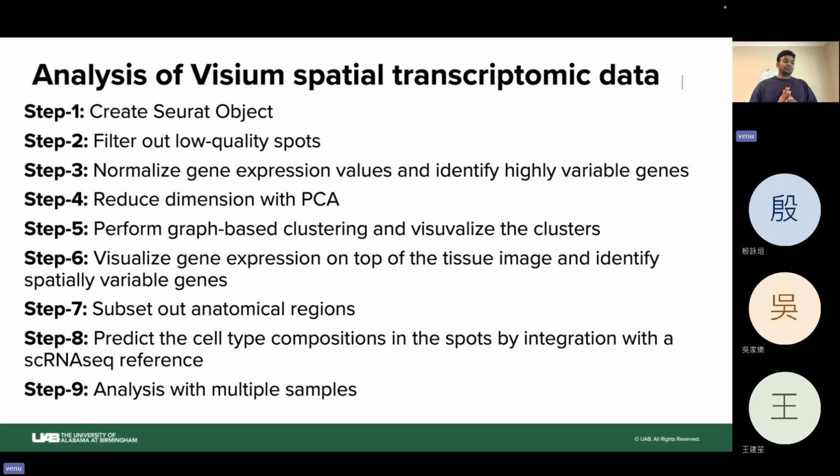That means if we see 10 spots having multiple genes, we already know from the starting of single cell and spatial analysis that people always split the spots or single cells based on their marker gene expressions. Here, we don't know what the markers are, so we consider, say, 1,000 spots, and these 100 spots are highly expressing similar kinds of genes.